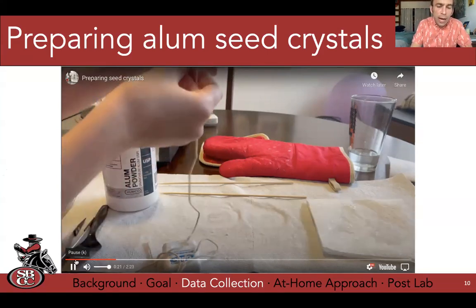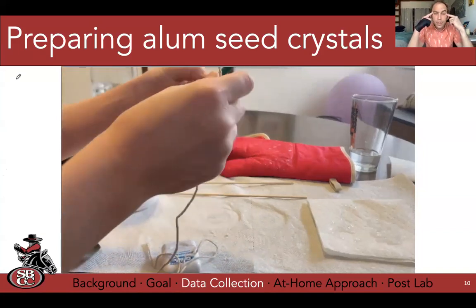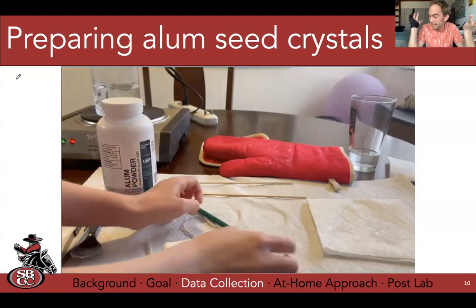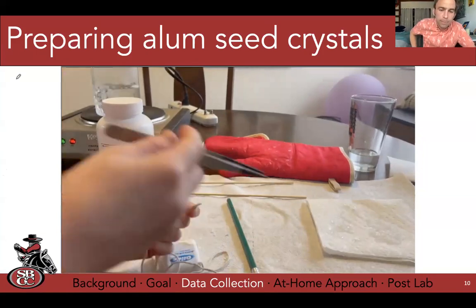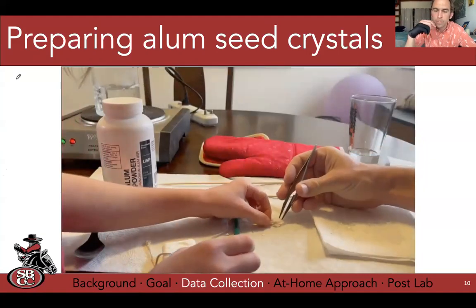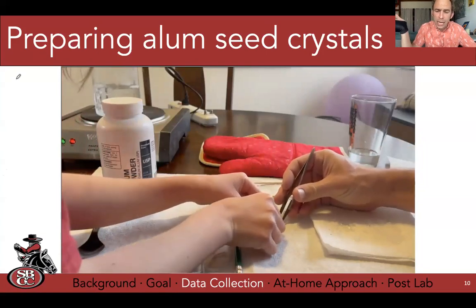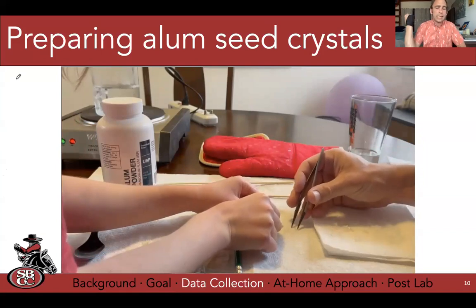This is the way that I devised, but it took me a long time to get it. By my 6th or 7th trial with this experiment, I was able to get it pretty quickly. So tweezers, but you'll also see us just using our fingers. So now I've come in because, also, if you have somebody else on hand that can be a second pair of hands for this step, this would be a good idea.